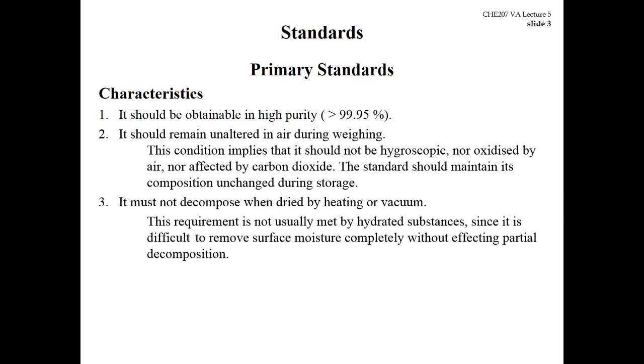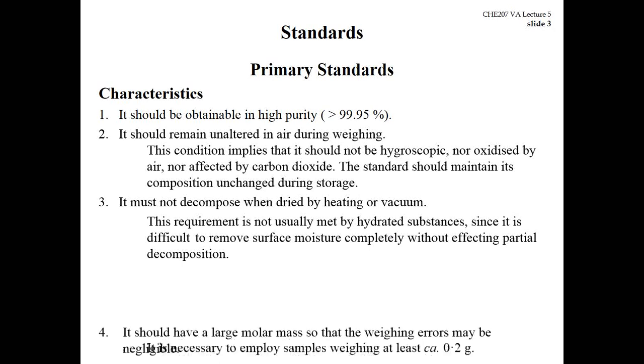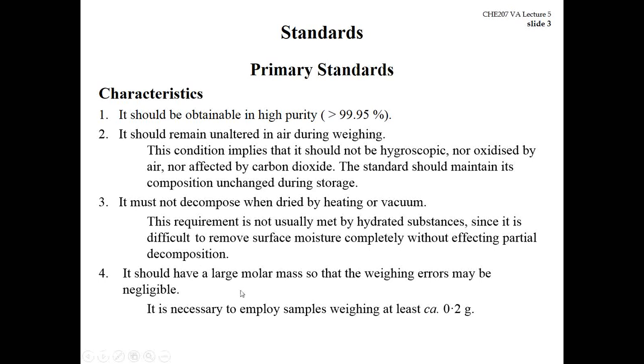So that's why most hydrated substances cannot be used as primary standards. For accurate weight, the primary standard should have a large molar mass to minimize the weighing error. So in general, the primary standard should be weighed at least 0.2 gram.